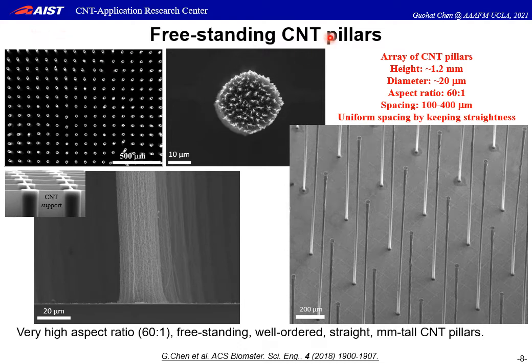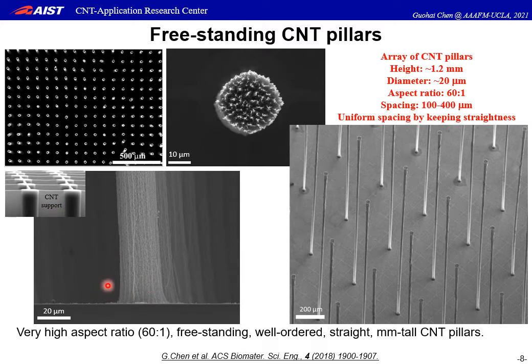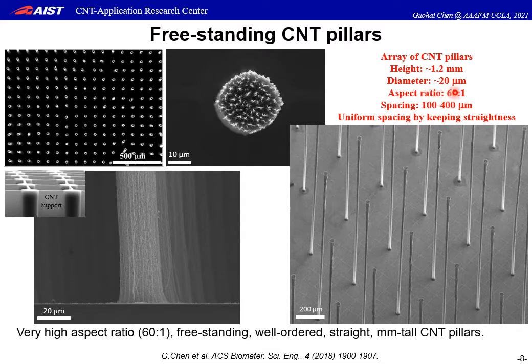Here are the final freestanding CNT pillars. As you can see in these SEM images, the CNT support was completely removed. This is before — the wall structure we call the CNT hatch — and after, they are completely removed. But the pillars still maintain their good alignment and straightness. This is another sample: the final CNT pillars have a height of about 1.2 mm and diameter of about 20 microns, so the aspect ratio is 60 to 1, which is very high. The spacing is about 100 to 400 microns depending on the sample, and we can still get uniform spacing while keeping straightness.